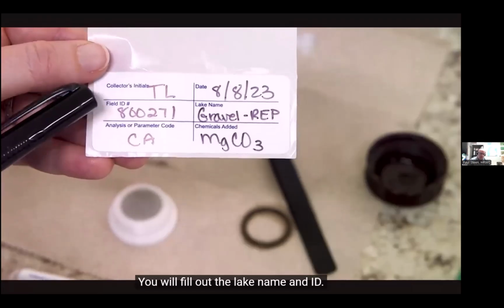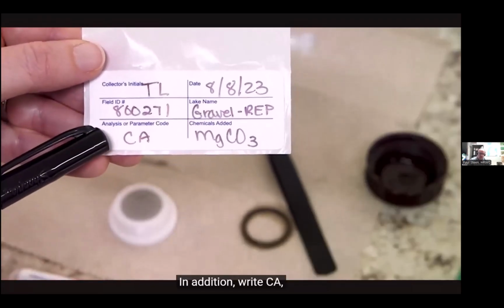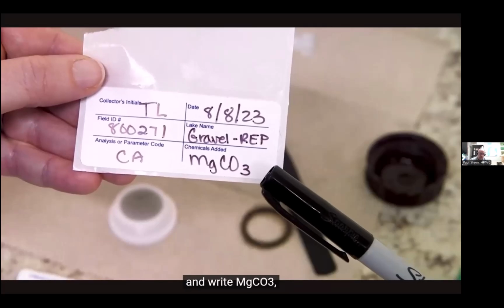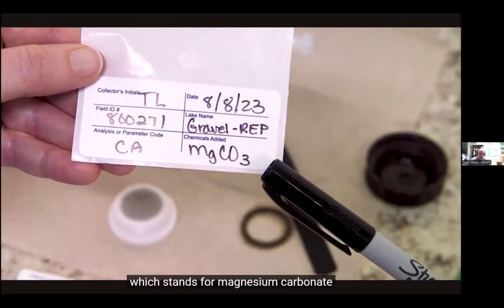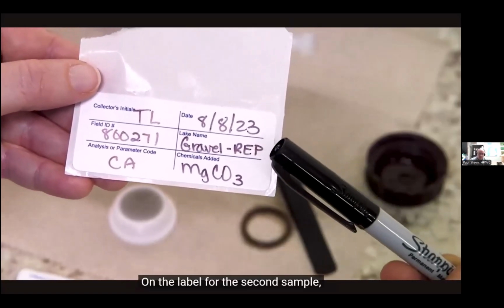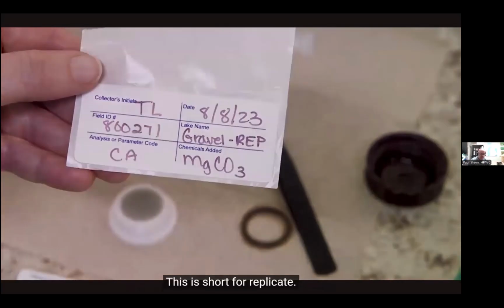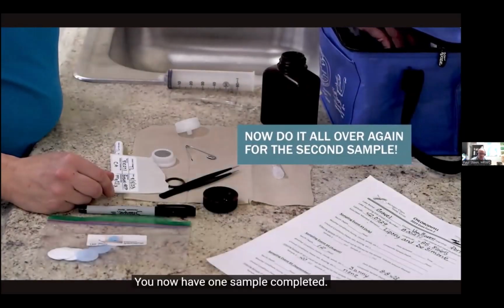You will fill out the lake name and ID. In addition, write CA, which stands for chlorophyll, in the parameter code box, and write MgCO3, which stands for magnesium carbonate, into the chemicals added. On the label for the second sample, write REP next to the lake name. This is short for replicate. You now have one sample completed.